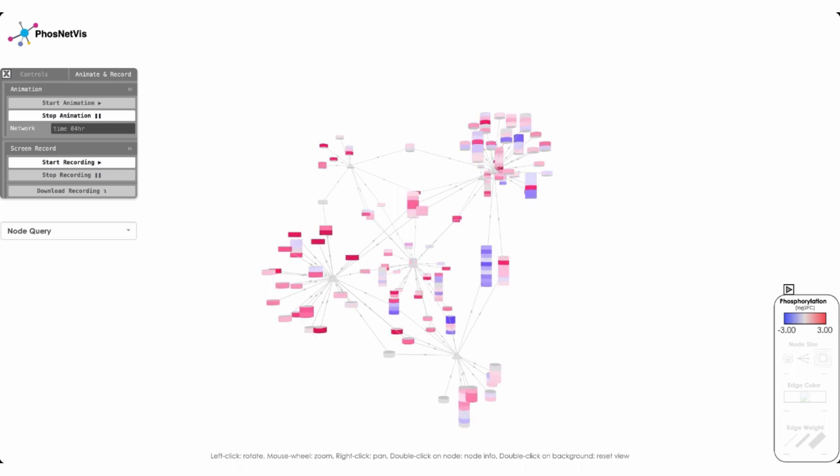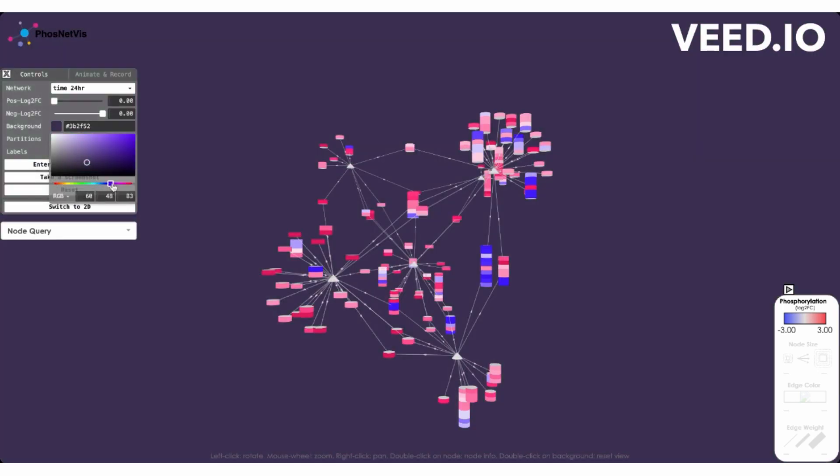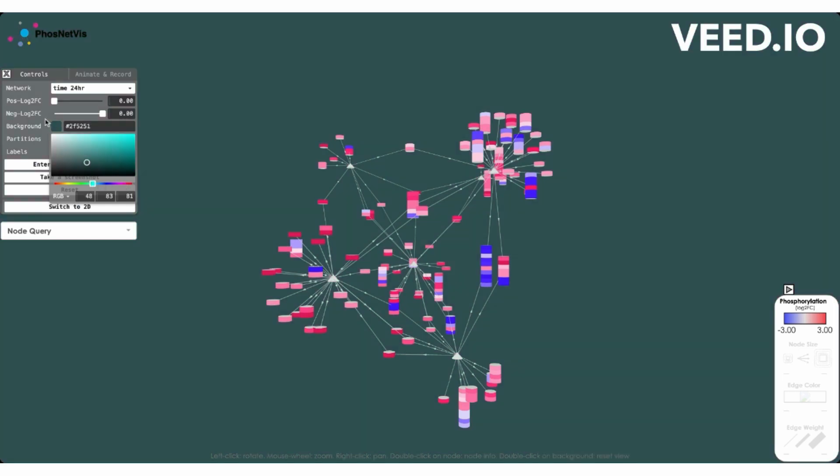So from time zero to time 24 hours, we can see that the phosphorylation levels are changing significantly. So we can stop the animation, record this, or take a screenshot. And if we go back to the original, we can also change the background based on the colored scheme that we like, which may work better for our specific purposes. And then also change the filters in terms of what is the specific cutoff for phosphorylation. And then also go back to resetting it.